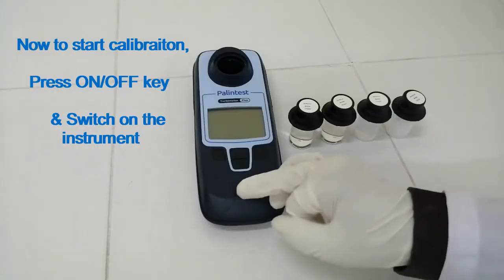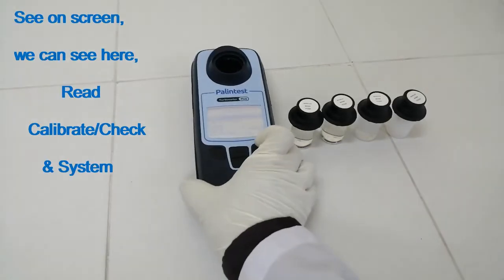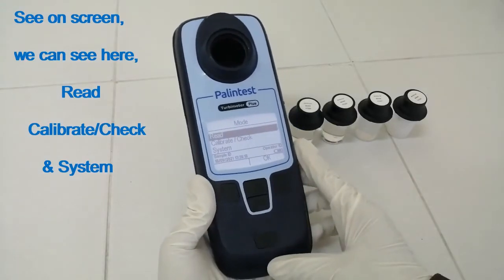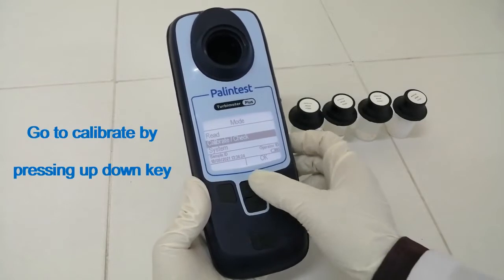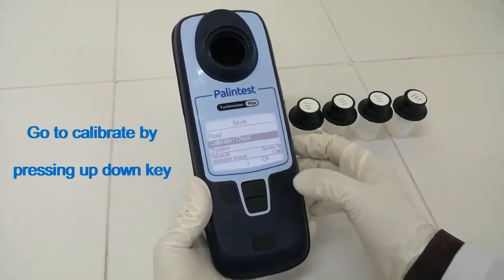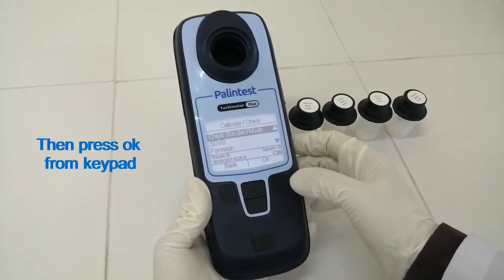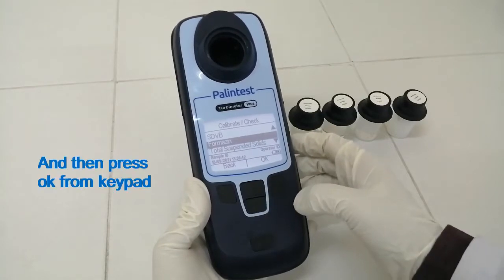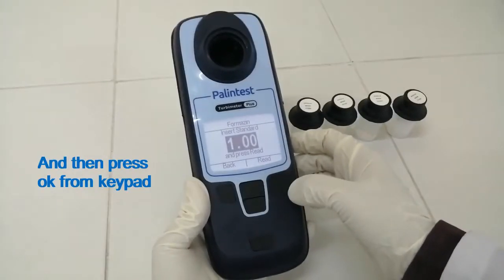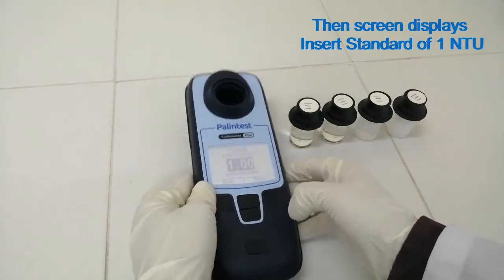To start calibration, press the ON/OFF key and switch on the instrument. On screen, we can see: Read, Calibrate, Check, and System. Go to Calibrate by pressing the up/down key, then press OK from the keypad. Go to Formazin by pressing the up/down key, then press OK. The screen displays: insert standard of 1 NTU.